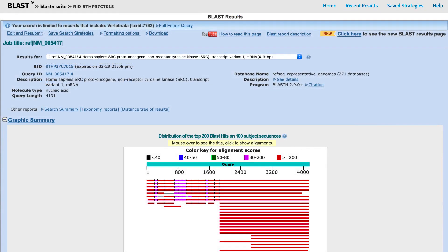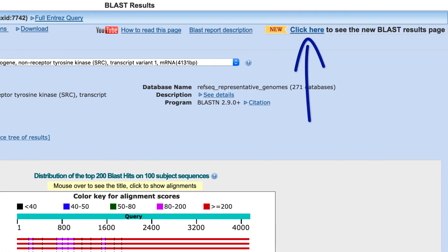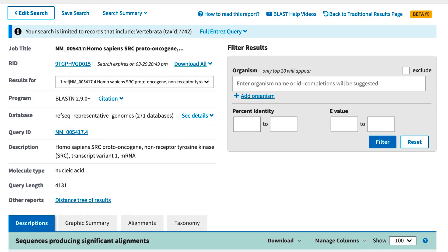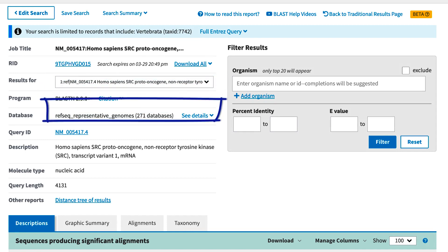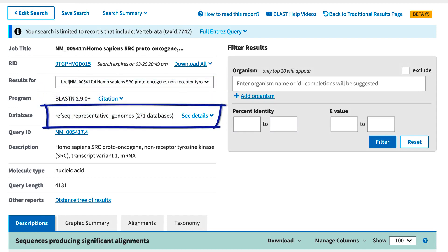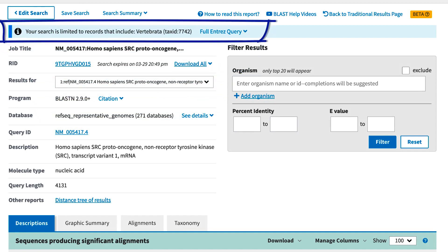So this is the current results format, and to see the new results page, I'll follow this Click Here link. I've run a search with two RefSeq transcripts as the query, against the database RefSeq representative genomes, limited in the organism field to vertebrates.